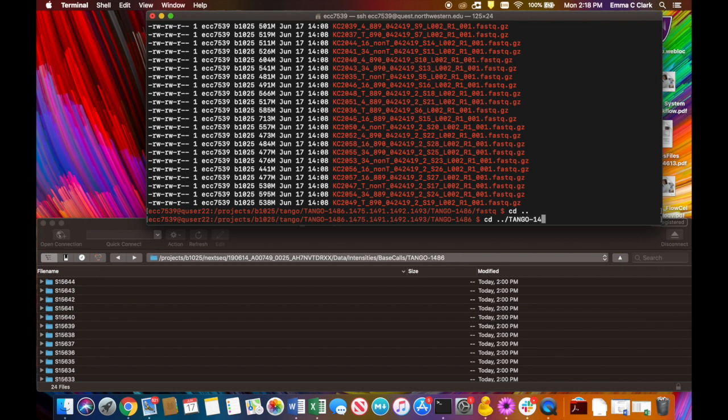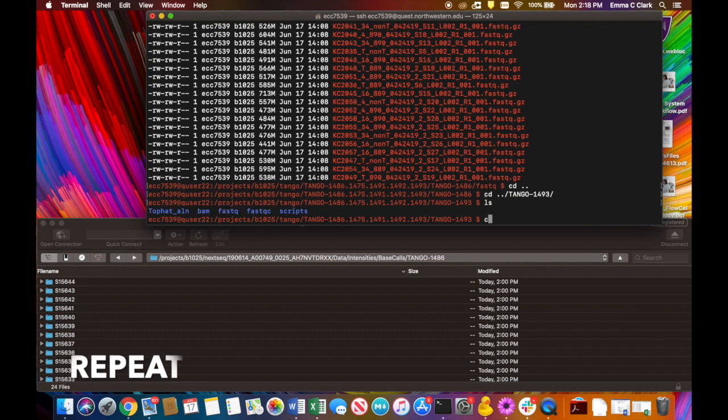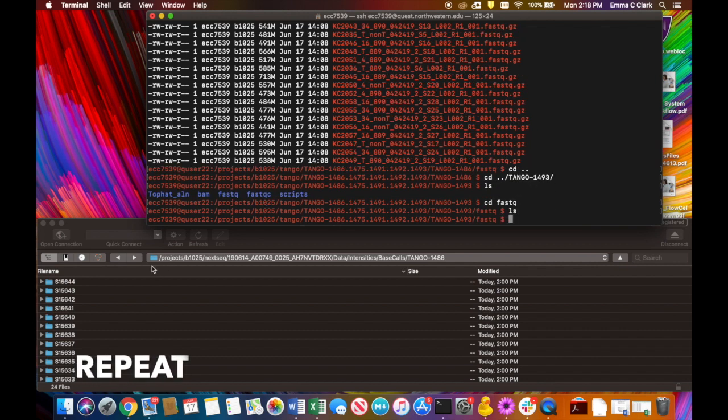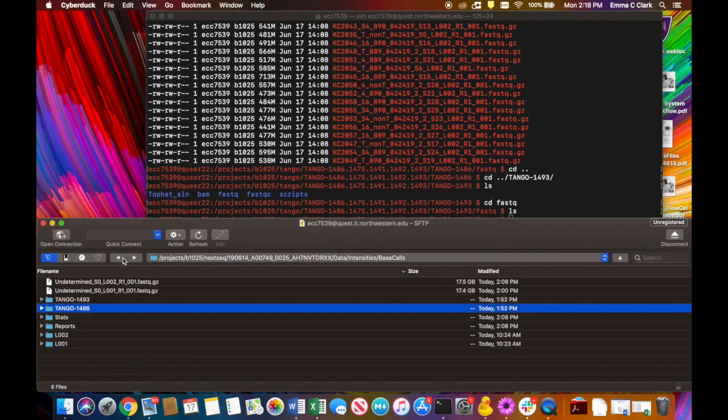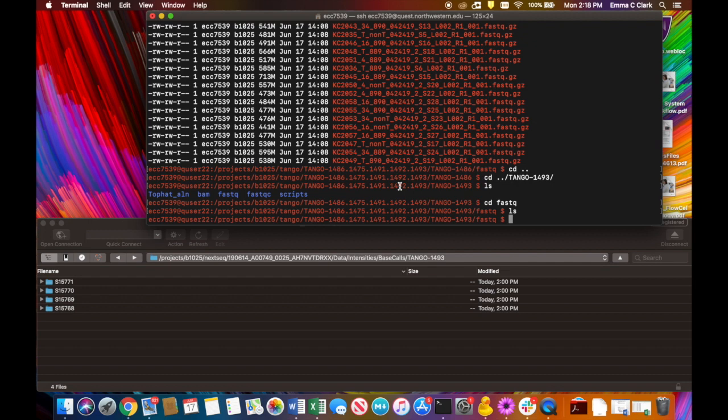Now we're going to move back, and we're going to do the same thing with the other directory, with the other project, sorry. So for 1493, we're going to do the same thing. Go into the FASTQ and make sure there's nothing there. There isn't, so cool. And we're going to do the MV command, or the move command, once again. Not Tango, NextSeq.